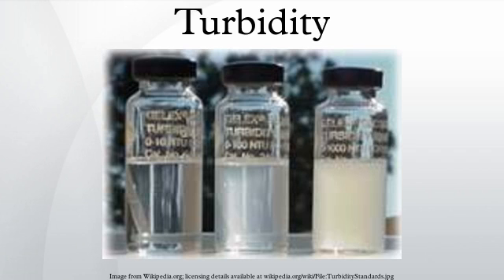Turbidity is the cloudiness or haziness of a fluid caused by large numbers of individual particles that are generally invisible to the naked eye, similar to smoke in air. The measurement of turbidity is a key test of water quality.